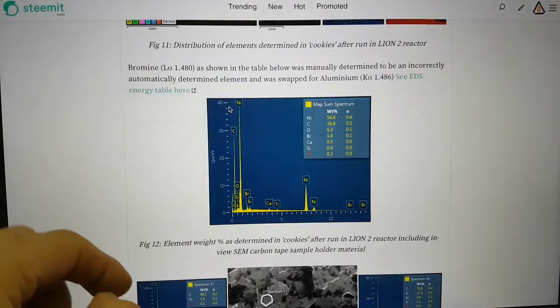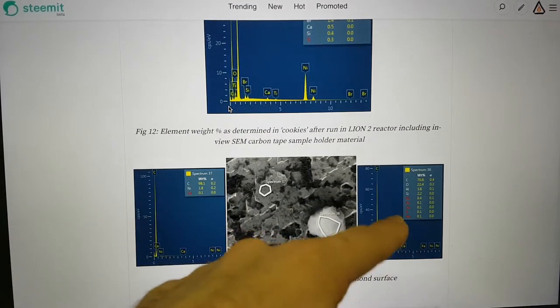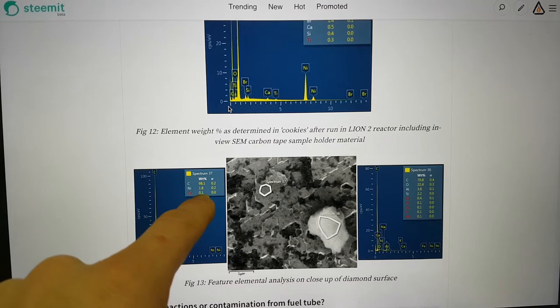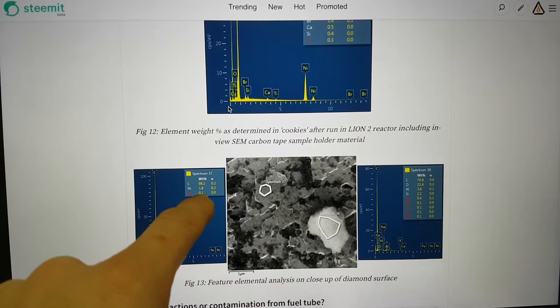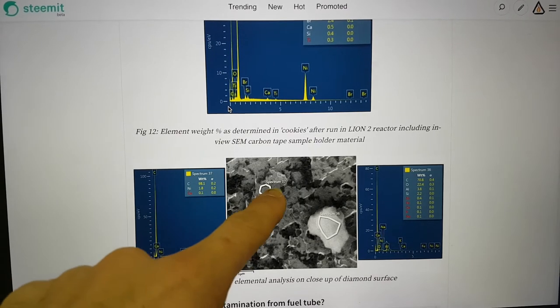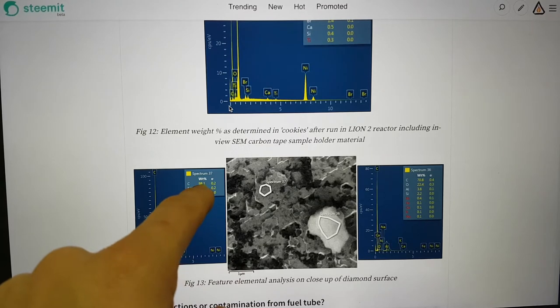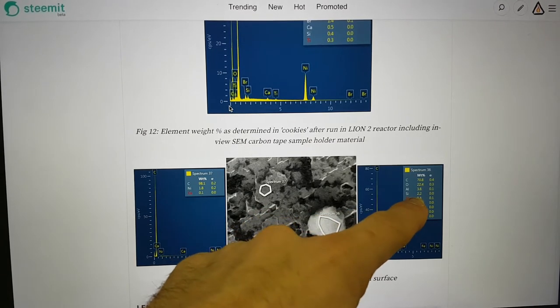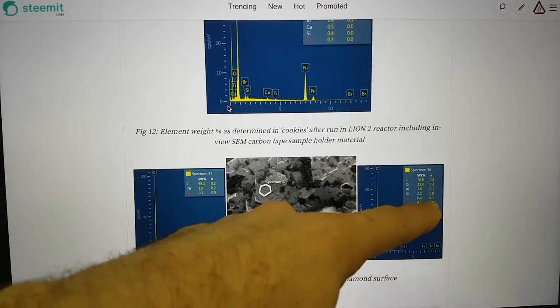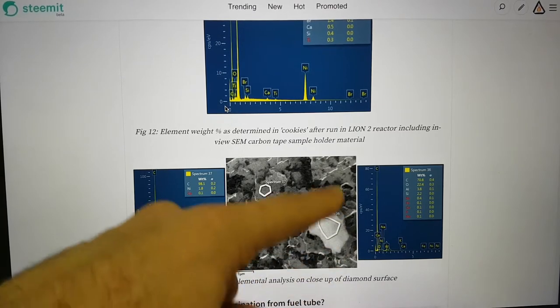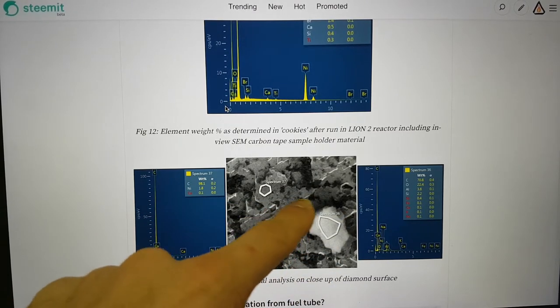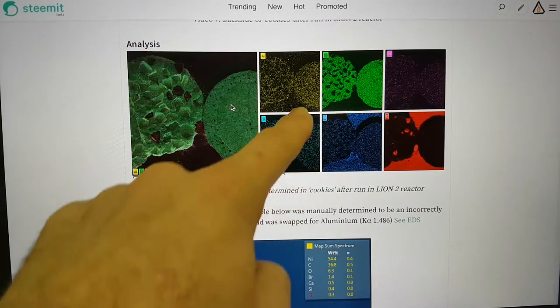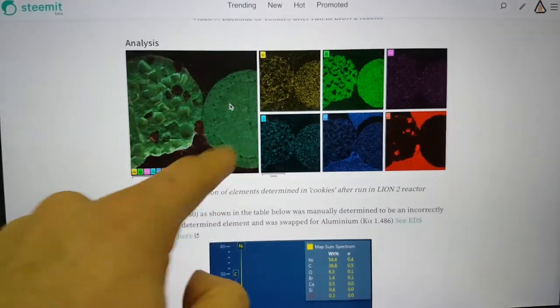So we have clear peaks of aluminum, silicon, calcium and titanium. However, it may be the sample time wasn't long enough or we needed a closer shot. But it appears there may have been some titanium there. Let's go in a little bit closer to the diamond. Observed essentially in this sample area 37, it was essentially carbon and nickel with some not determined amount of calcium in this kind of flat area.